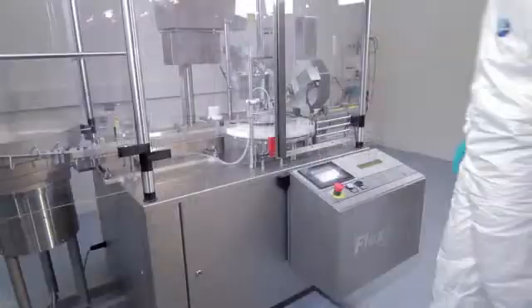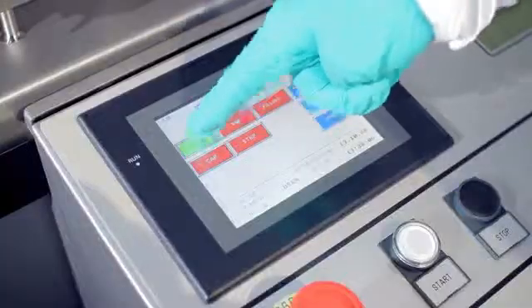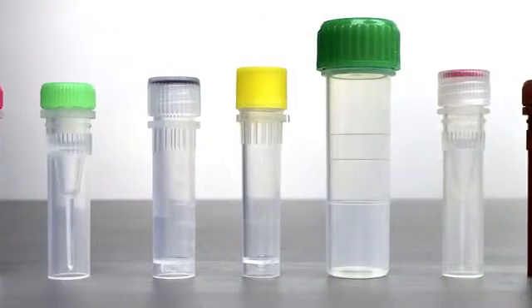Flexicon's FMB210 is a family of fully automatic filling and capping machines capable of working with many different liquids, fill volumes and a range of containers.